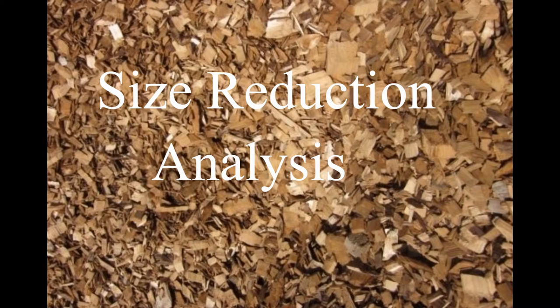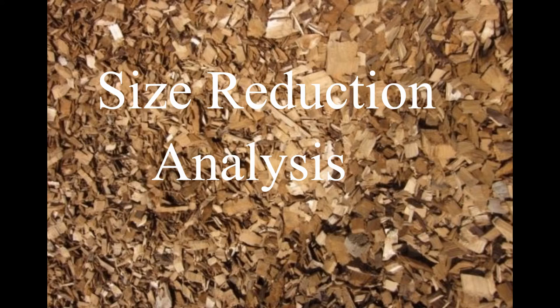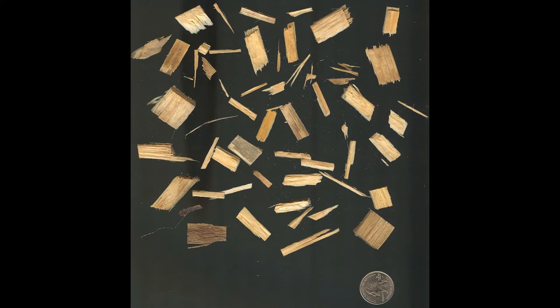Next, let's move on to the setup of the lab. First, make sure ImageJ software is installed on the computer you wish to use. After that, either obtain image files of scanned biomass particles or gather your biomass you wish to use for the particle analysis.